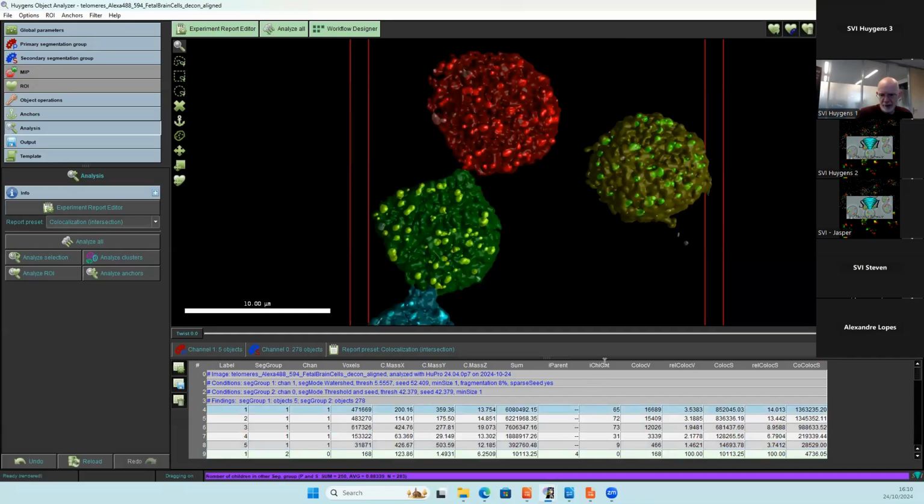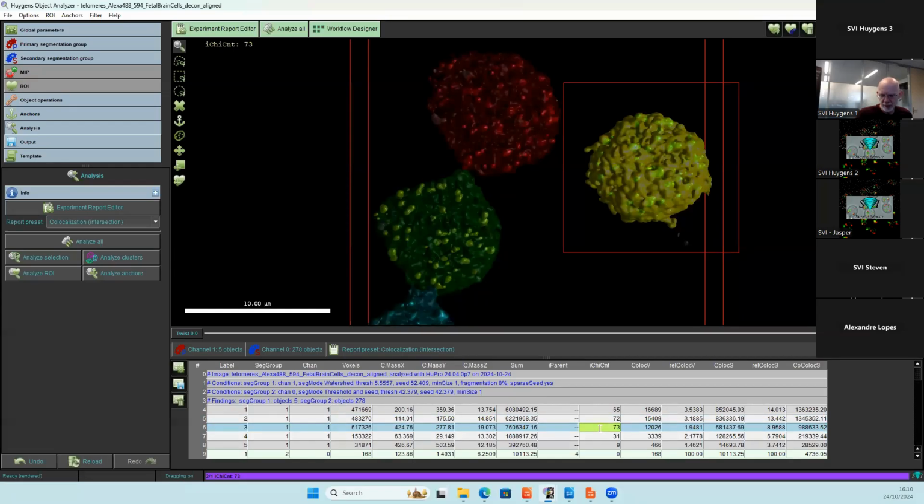On the right of that, that's an interesting field, of course, we see how many children there are in the parents. So in the most right nucleus, we, for example, see that there are 73 children. If we double click on it, it is highlighted.